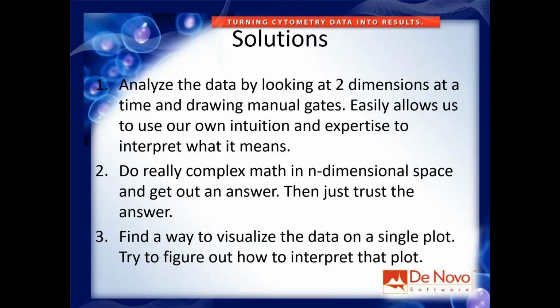But actually, at the end of the day, with all the fancy graphs, you do have to end up going back to these two-dimensional plots to understand what these graphs are telling you. And we'll get into that a little bit later. Looking at the two-dimensional plots is still the only way that is really biologically meaningful and really biologically interpretable. So they're still really important, and you still have to look at a lot of them.